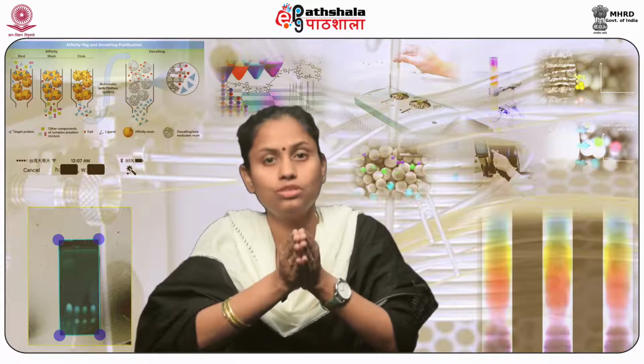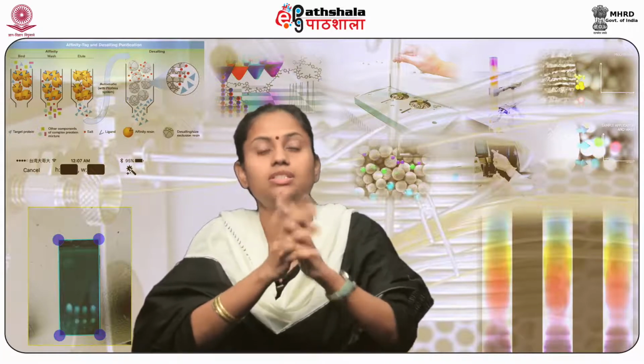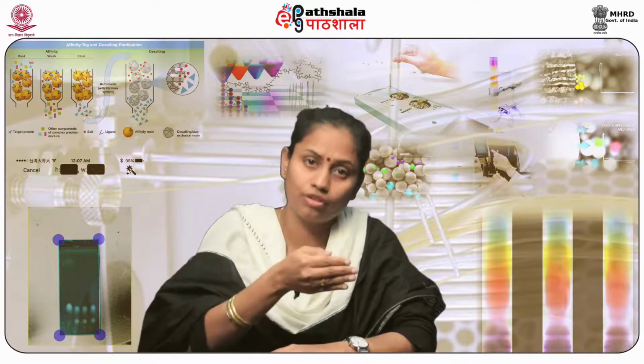The density of exchange sites on the stationary phase surface also affects the separation or elution procedure in ion exchange chromatography. Here we are also talking about the cross-linkage present in the matrix of the stationary phase. The cross-linkage of the resin can be modified by altering the organic coating to provide more or fewer exchange sites per unit area as required for the elution.